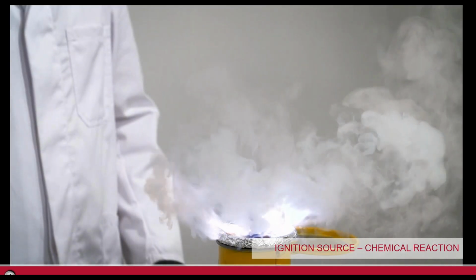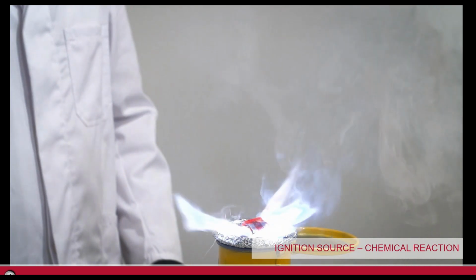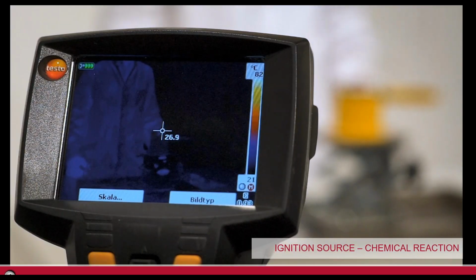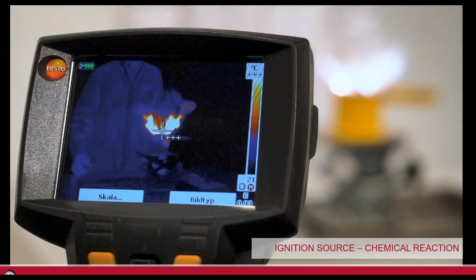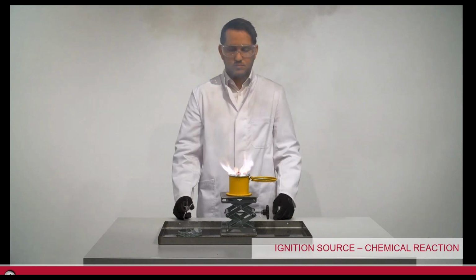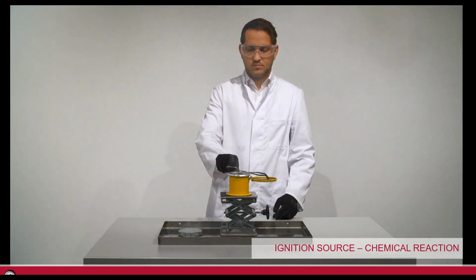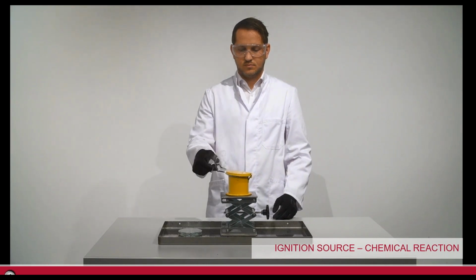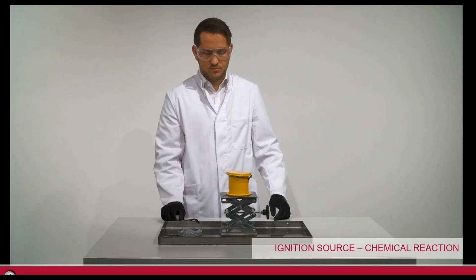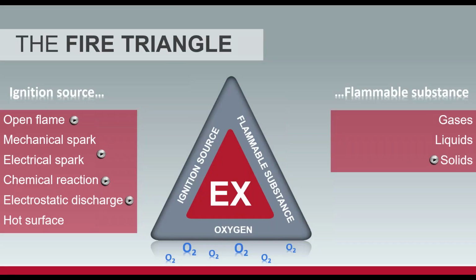That gets hot fast. If you watch the heat gun that shows the temperatures on this, it's amazing how hot, how fast the chemical reaction can happen. Again, how can we keep that from happening? Education and segregation of these chemicals, storing them in proper places. Right, so there's proper boxes to keep things in. You guys create a proper and a very safe zone, and then we educate the end users, the scientists, on how to use those types of technologies. All of those have to happen, or it just doesn't quite happen well.